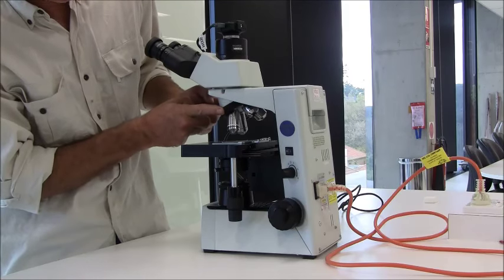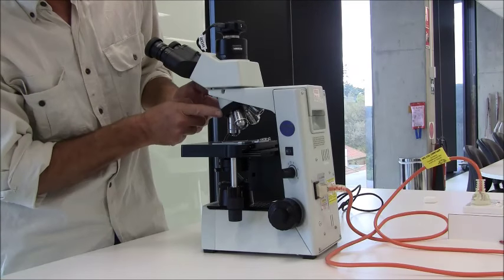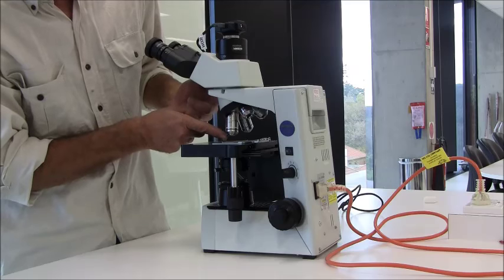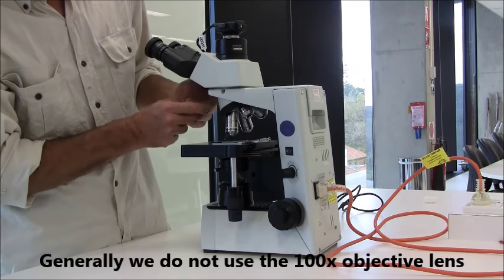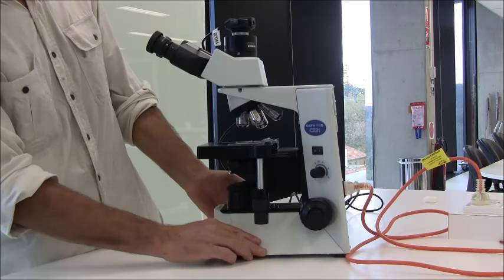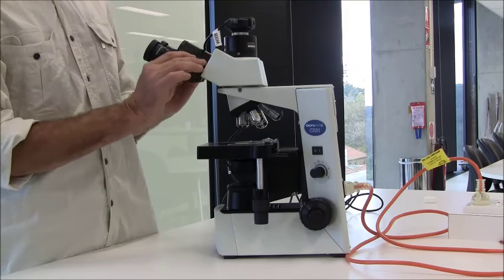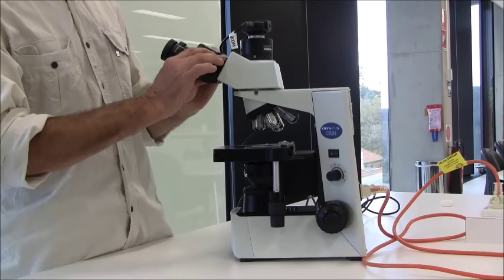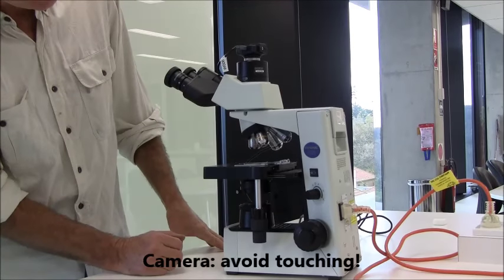We don't use that 100x lens. In fact, be careful about rotating it into position — if the specimen is fairly thick and you rotate that white lens into position, you're going to jam it into the specimen, and maybe crack the slide or damage the objective lens itself. So generally, we don't use that one. The eyepiece lenses allow you to adjust the interpupillary distances, the distances between your eyes. On the top is a camera so that the image can be sent to your computer.